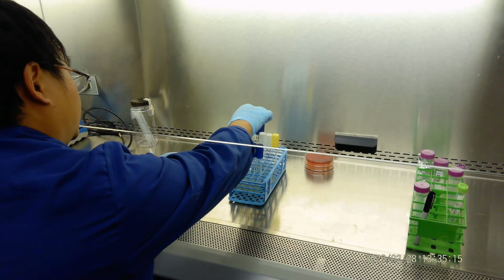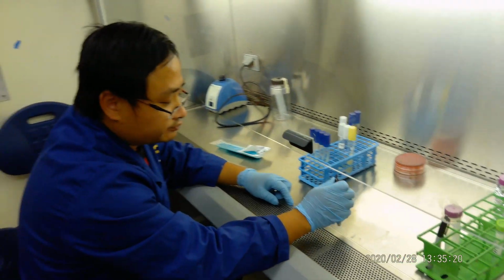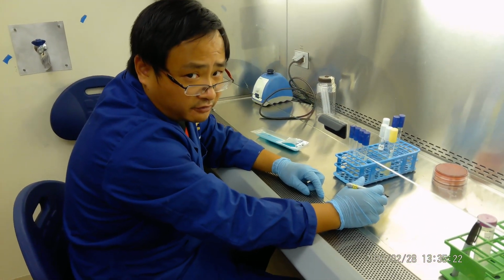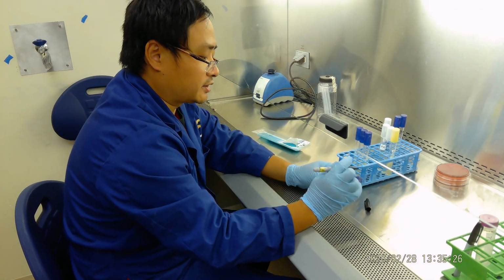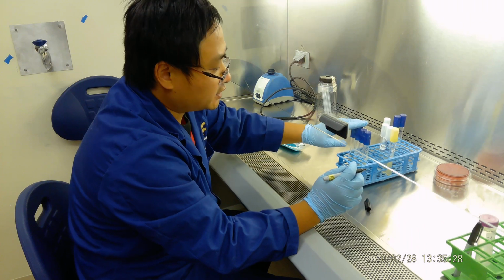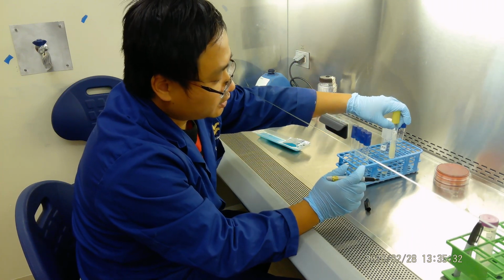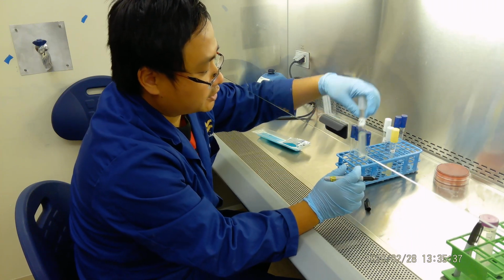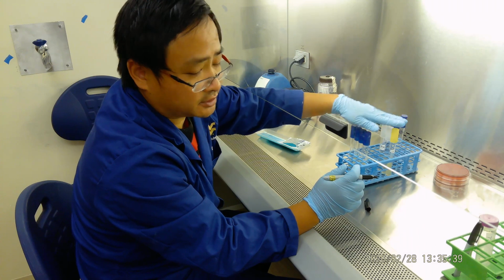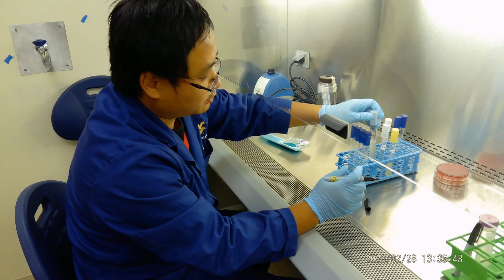Now the second job is that we want to see the impact of temperature on bacterial growth. You know the psychrophiles, mesophiles, thermophiles. So we want to label these at different temperatures. Now you will be assigned a culture. Each of you will do either Staphylococcus aureus, E. coli, Pseudomonas aeruginosa, Bacillus subtilis, or Bacillus cereus. So let's say we do E. coli. So how do we do it?